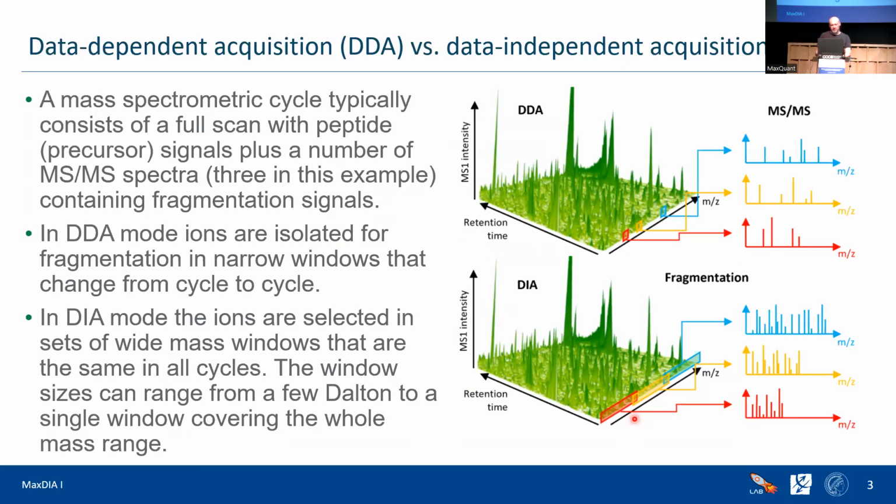So at least if you concentrate on the fragmentation data coming from one of these windows, this will produce, similar to what you see for MS1 here, also such a plane of continuous data, in which you can do higher dimensional feature detection. Here it's shown for the retention time, but the same is valid also for the ion mobility if you have it, right?